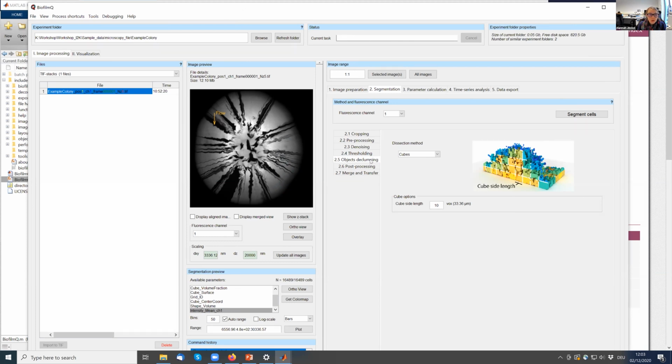I typically do not recommend for anyone to use less than 3 pixels or voxels as a cube side length if you have a normally sized image like this one, for example, 1024 by 1024, just because it gets really, really slow. So in our case, I think I will decrease it to 4 so that we don't go too low, but we do go significantly lower. Now I'm going to segment this again with a cube size of 4 and see what the difference is like.